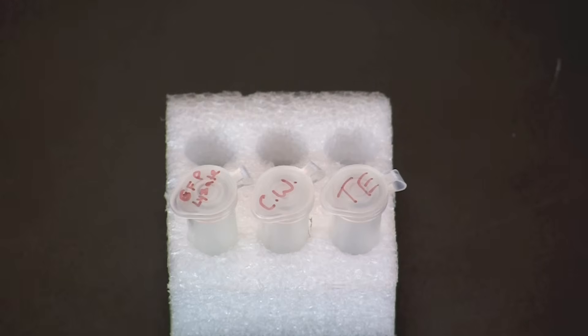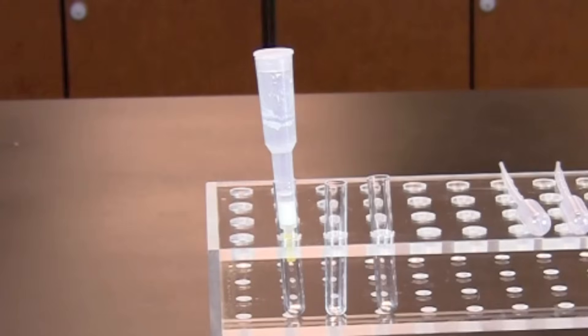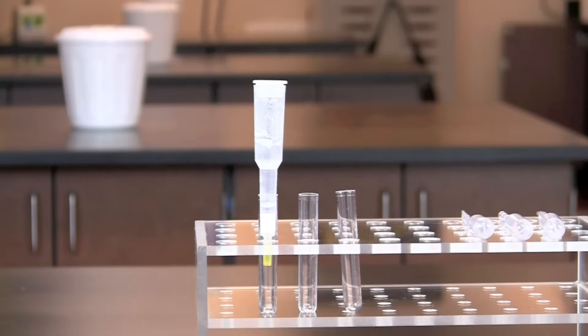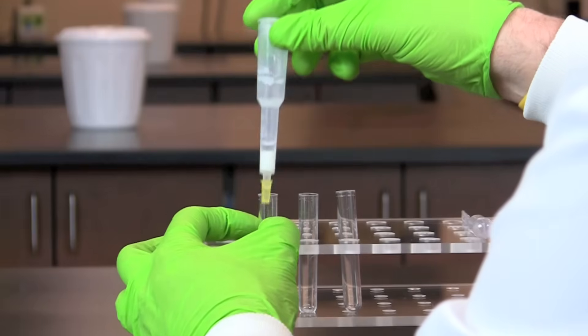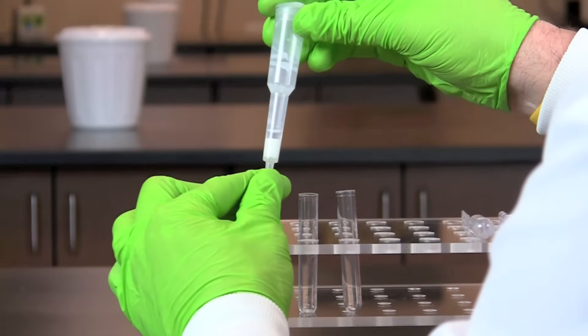For this activity you will need 250 microliters of bacterial lysate with GFP, 250 microliters of column wash buffer, and 750 microliters of TE buffer. Label three collection tubes one, two, and three, and place them on a rack with the column. To prepare the column for use, remove the caps from the top and bottom of the column.